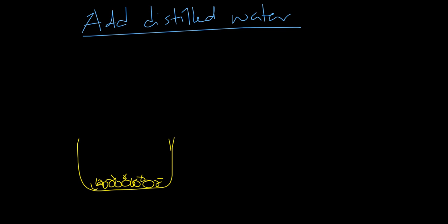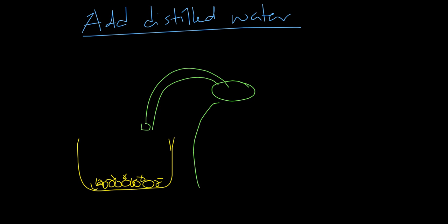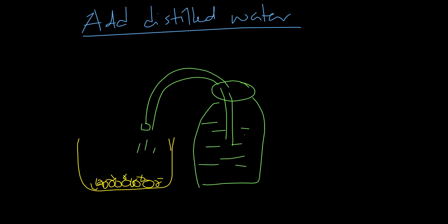All we need to do is bring in the bottled water, that's what we call it. So this bottled water comes in. Remember, it contains distilled water. So this wash bottle comes in, containing distilled water. We pour an appropriate amount of the water into this beaker, and we are doing that so we can dissolve the sodium hydroxide. Remember, it is distilled water.